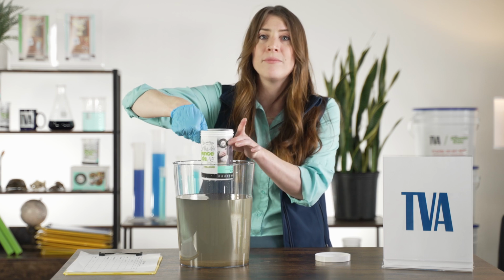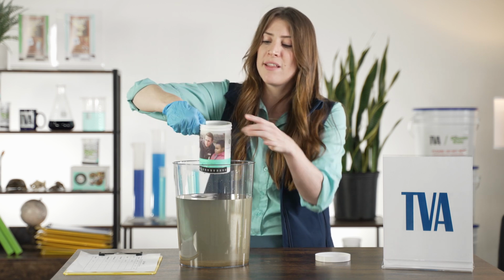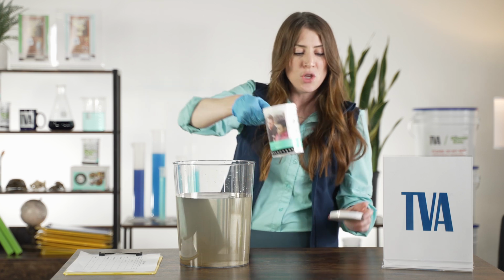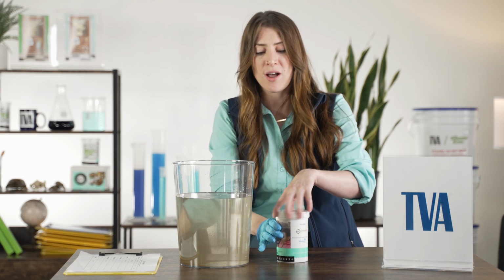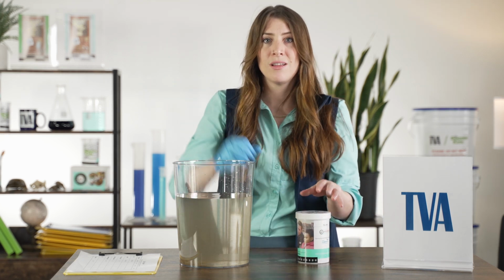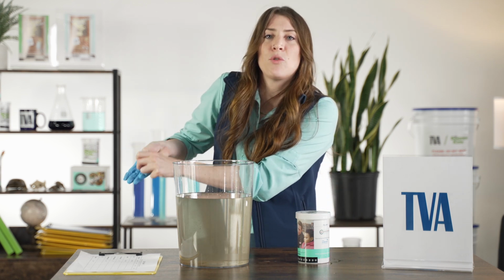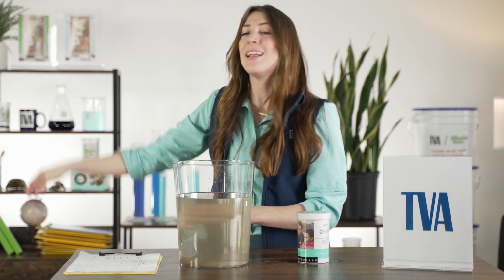Remember that fill line? You're going to want to pour a little bit of that water back into the bucket till it's approximately at the fill line. Then you can put your lid back on, screw it back on, and take it back to your workstation. Finally, remove your glove by holding your hand down and pulling it from your wrist to your fingertips and throw it away in the trash can. Now it's your turn.